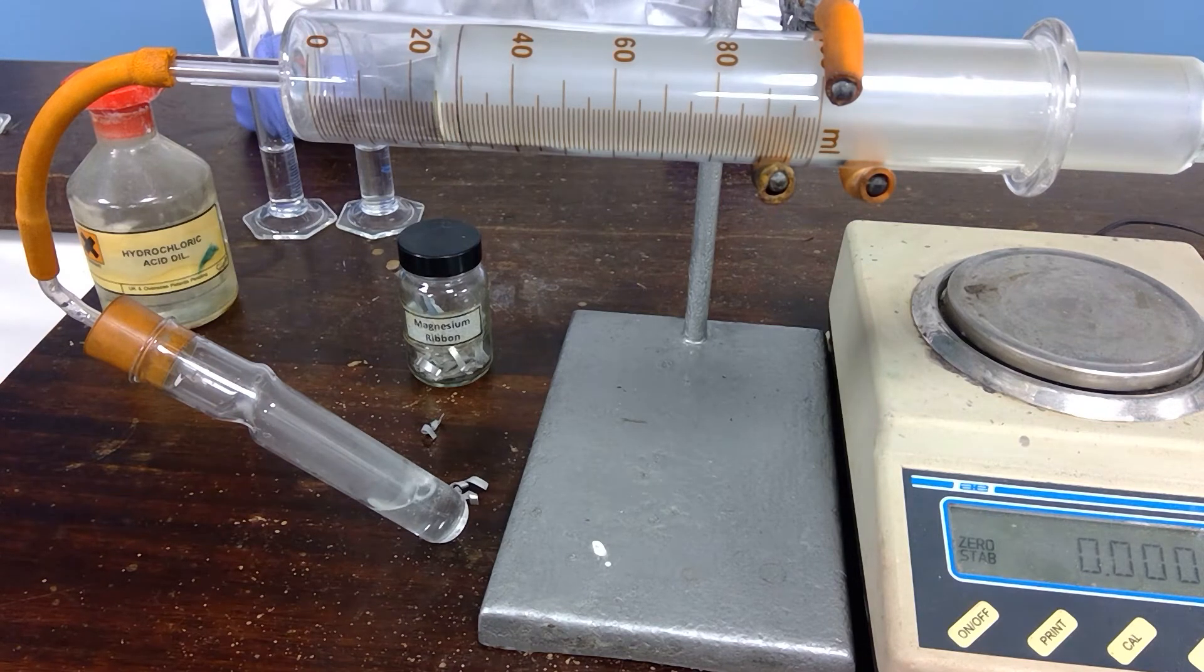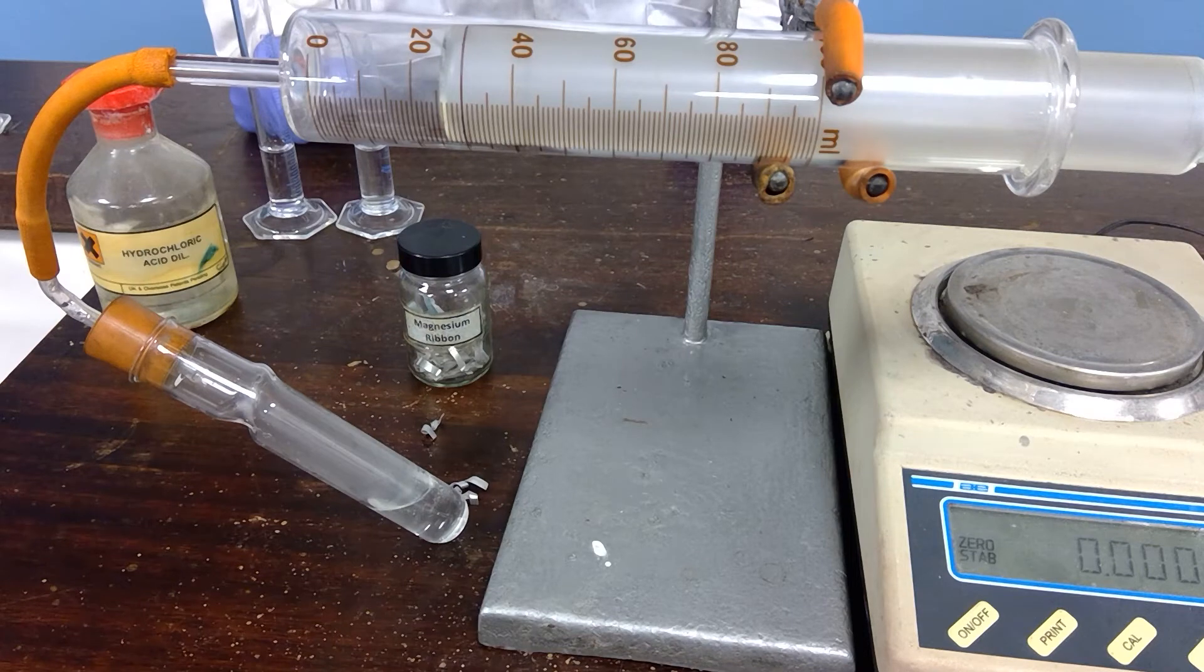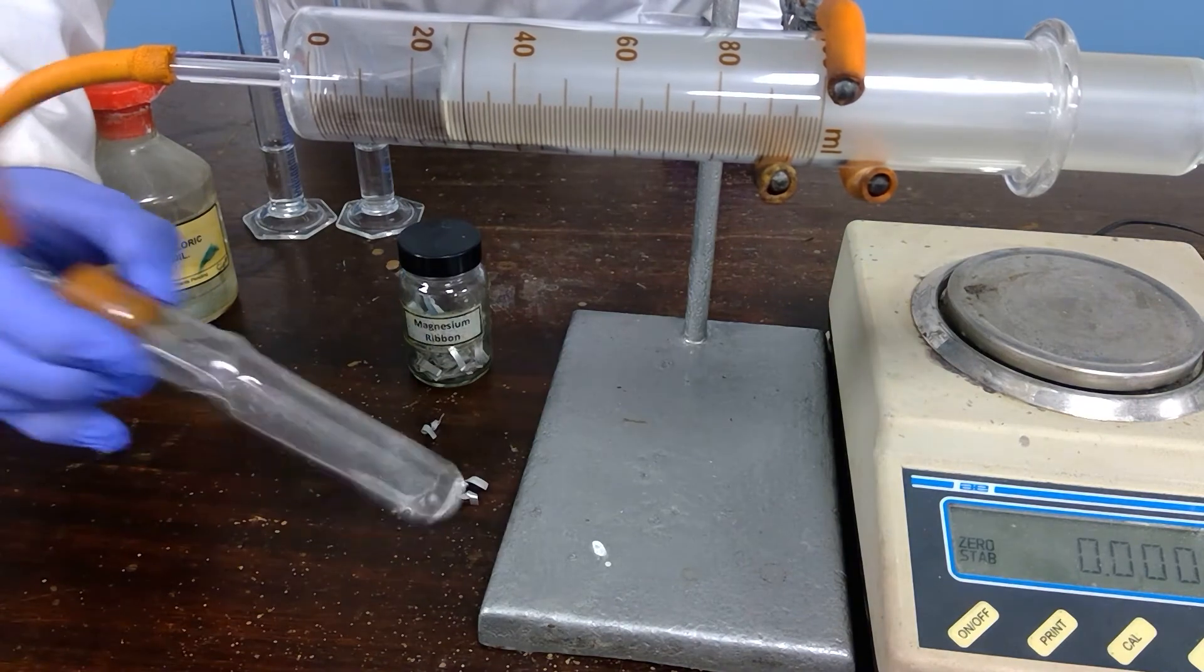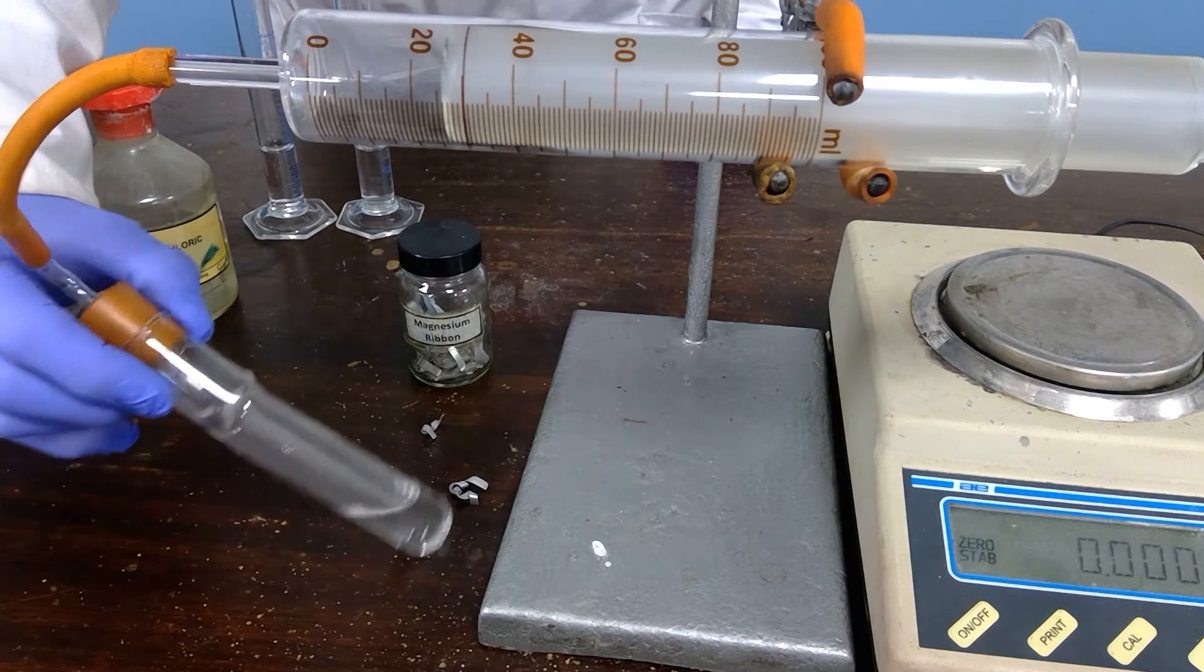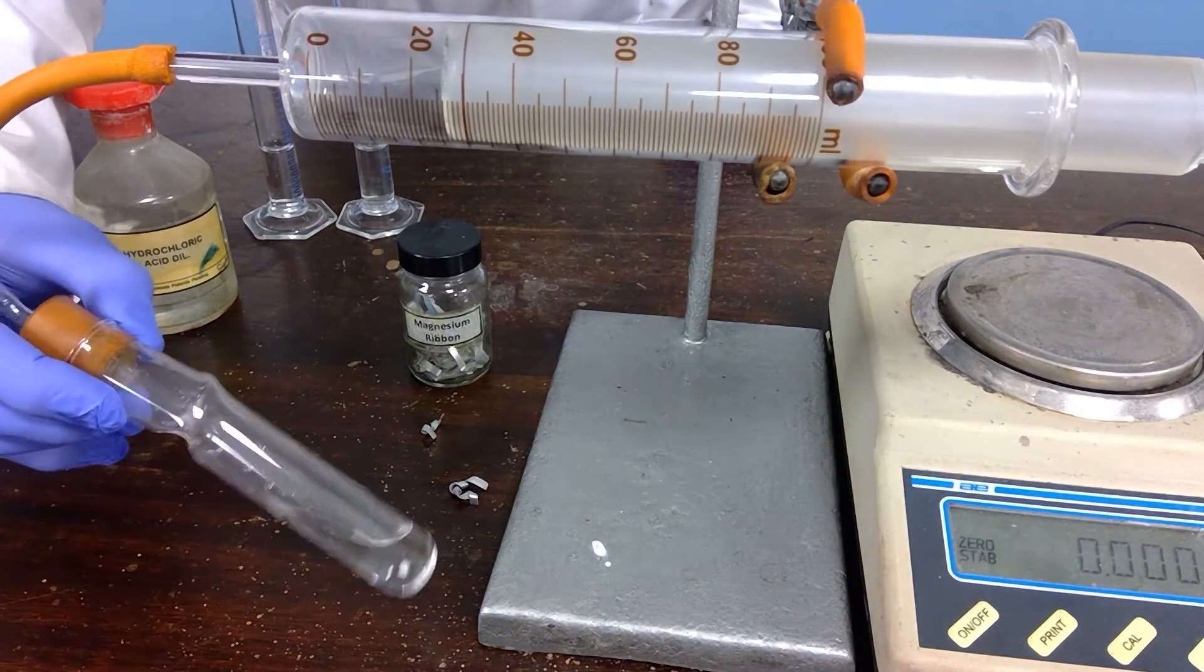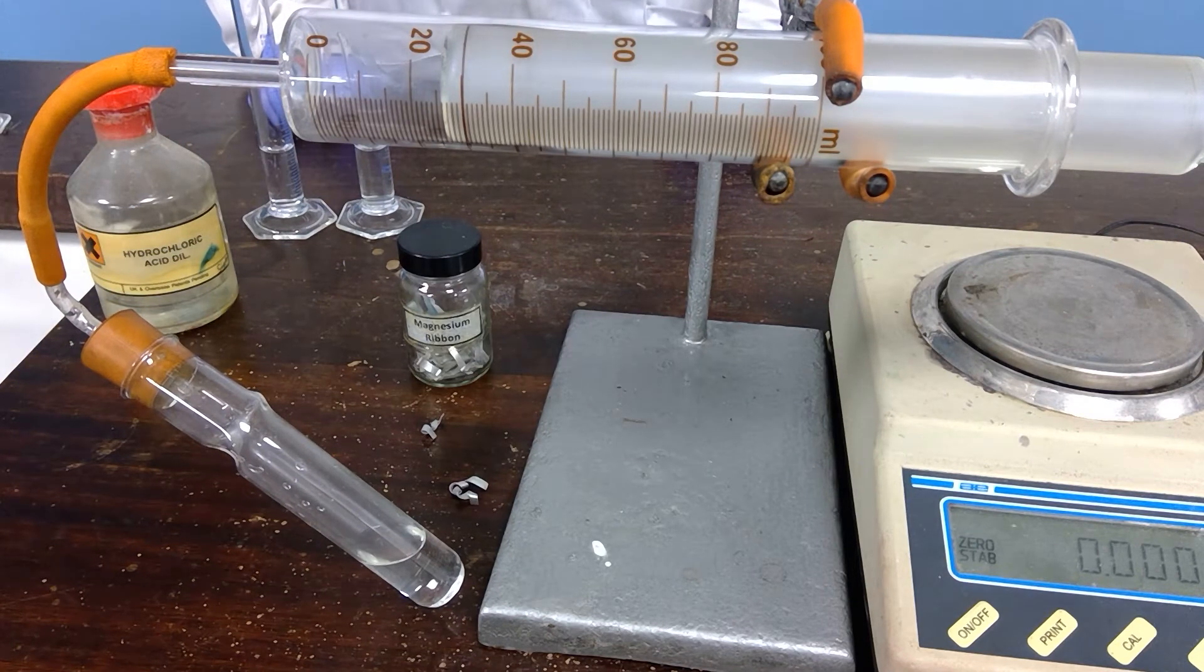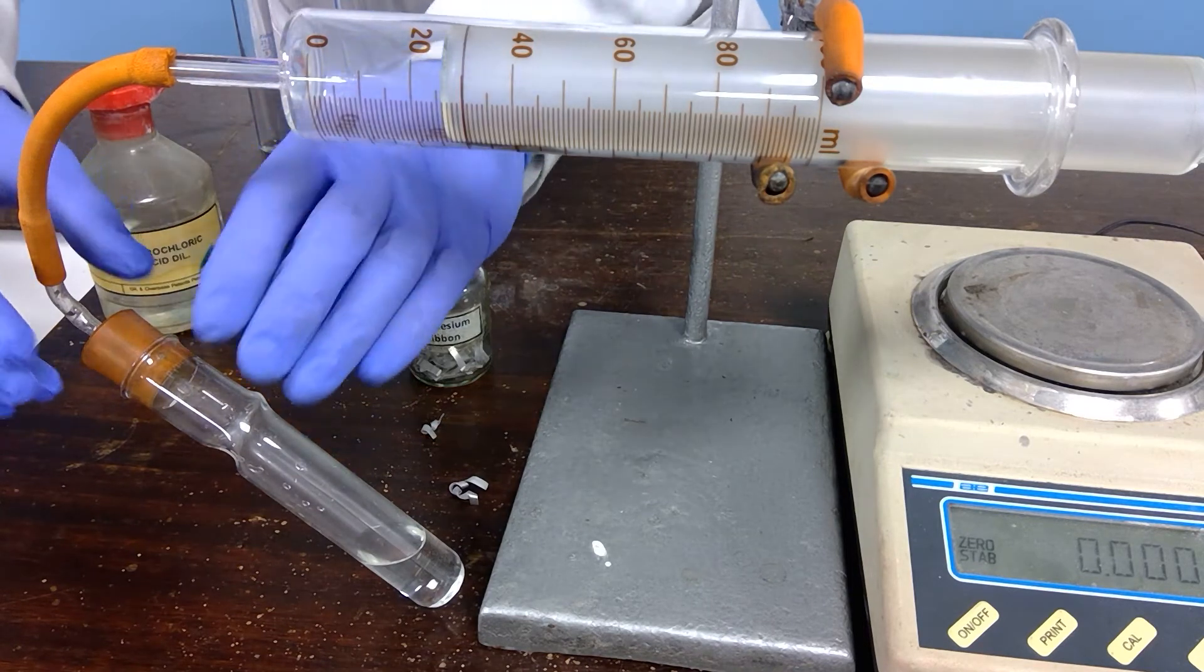There's still bubbling occurring, the rate of reaction is diminishing. We are still producing some hydrogen gas but it is slowing up, and eventually it will reach a point where there is no more magnesium left because the hydrochloric acid is in excess. If you would like to take that reading, we'll move on to the second experiment now.